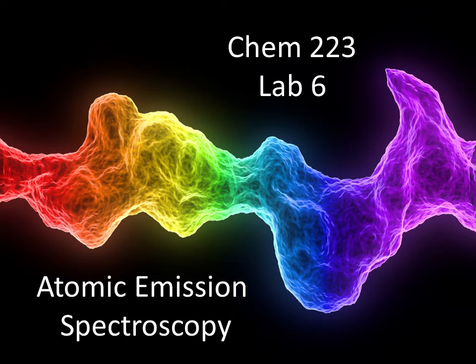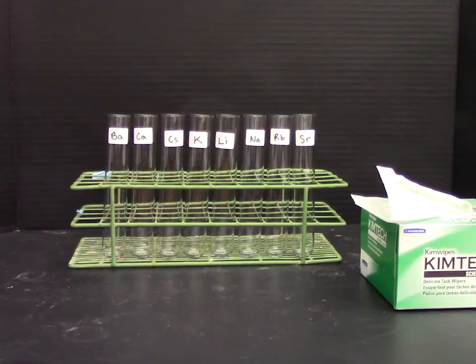This is the video for Chem 223, Lab 6, Atomic Emission Spectroscopy. We'll start by making standards of the 8 analytes of interest. This lab is completely qualitative, meaning it has no quantitative components.